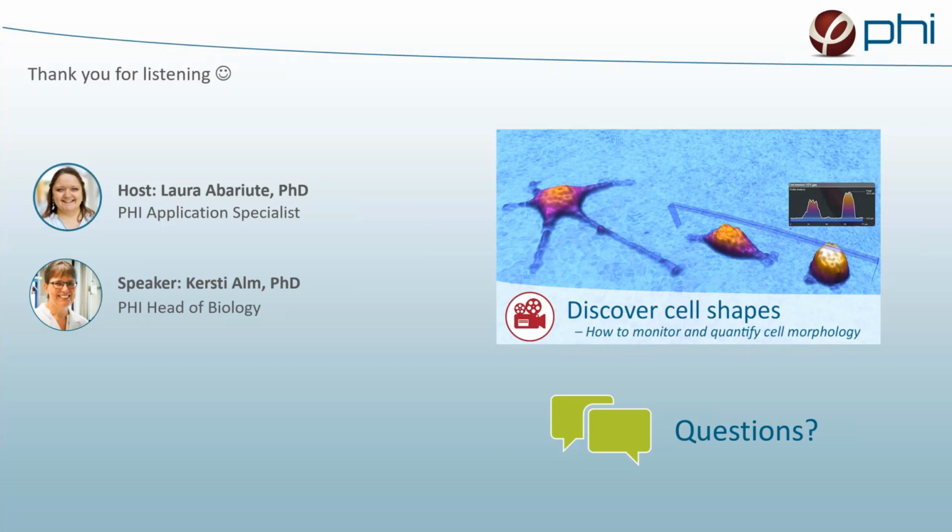And there are so many, are they all relevant? That's a very, very interesting question. Thing is, a lot of them are obviously relevant, like changing area or volume or thickness or irregularity. All those are obvious because you can see it directly. Other ones are more obscure, but are still very interesting. And because holographic microscopy is a rather new science still, we are not sure what each parameter corresponds to, biologically speaking. We are not sure when the hull convexity, for example, which is the dome shape of the cell, shifts, what biological occurrence is that corresponding to? We don't really know that yet, but we hope that you listeners will be able to tell us in a few years.